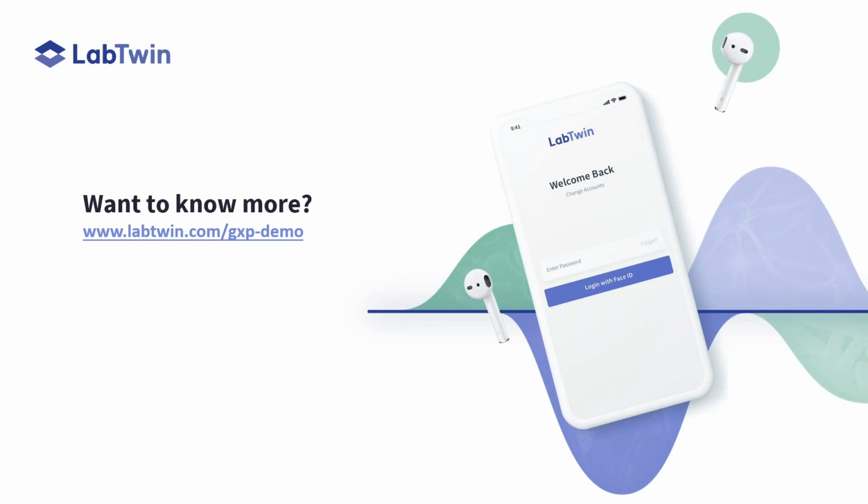The only other thought I had is that in pharma, with small molecules, we think about process analytical technologies, PAT. We also have another concept called real-time release testing, which is in certain areas but not widespread in pharma. When you look at those two things, I could definitely see a digital assistant helping to make them more readily available to larger segments of the industry.